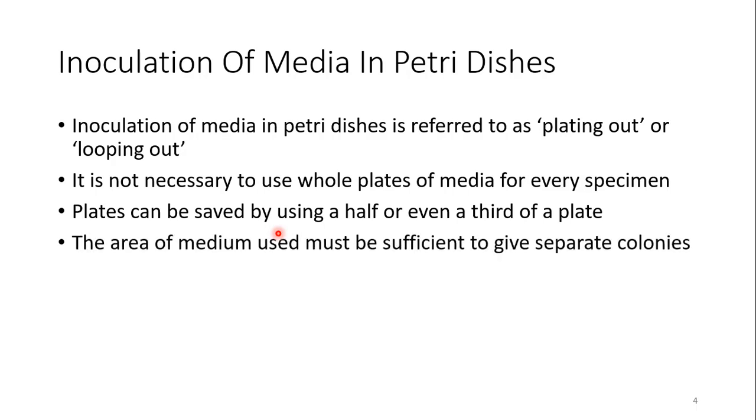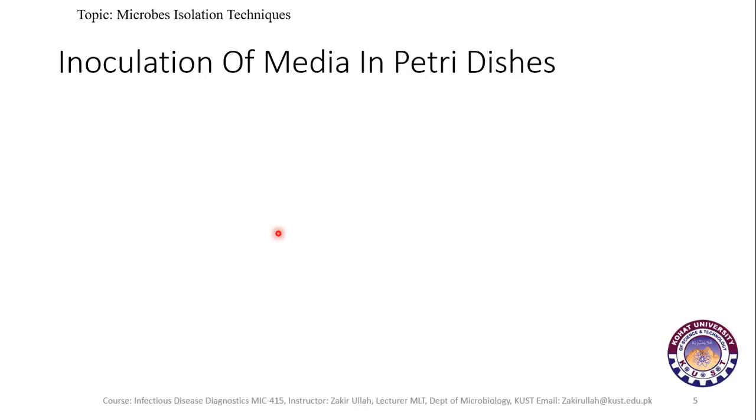The area of medium used must be sufficient to give separate colonies. This is important, that the medium should give us separate colonies, so such an amount of area should be used.